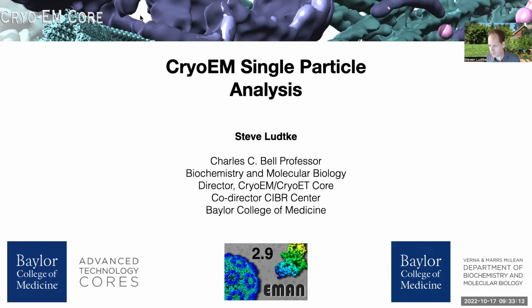The motivation of this little mini series of sessions is to bring up to speed the two rotation students in my lab, and to give Eric, who hasn't been at any of our EMAN workshops because we didn't hold any during the pandemic, and other beginners in my lab, an introduction to some of the stuff required for single particle analysis and subtomogram averaging in EMAN.